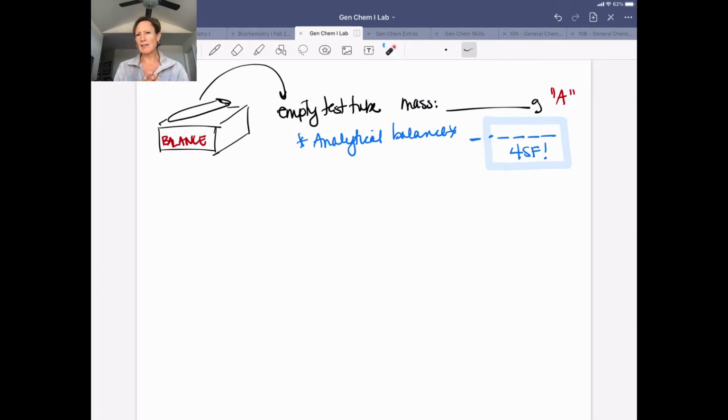I want to make sure to highlight that Dr. Brown has a great video that goes through a lot of the experimental work, but we're doing things a little bit differently this year. We're going to be using a Bunsen burner to provide the heat rather than a heat plate. There are 2 videos there that show Bunsen burner use, and then the overview of the experimental work uses a heat plate. So we're going to be using a Bunsen burner. And also, because we're using a Bunsen burner, we're going to heat our salt in a test tube, not in a beaker. So just keep that in mind as you watch those 2 videos, to understand that we are doing things experimentally a little bit differently.